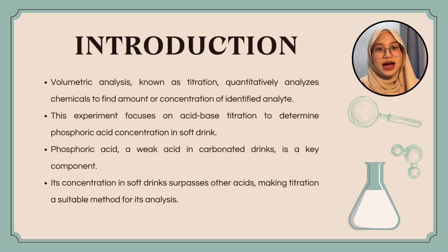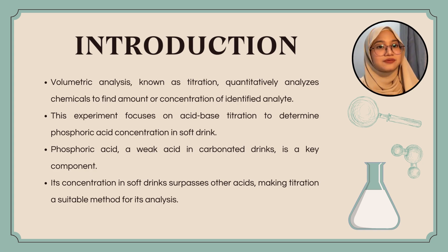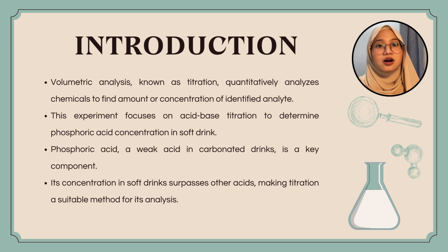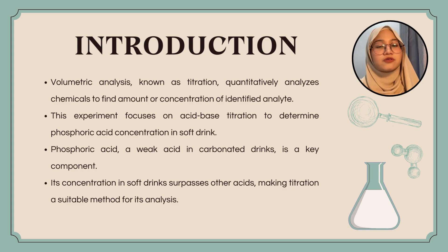Volumetric analysis, also known as titration, is a common laboratory method of quantitative chemical analysis used to determine the amount or concentration of an identified analyte. In this experiment, we will conduct an acid-base titration, which is a fundamental form of volumetric analysis.